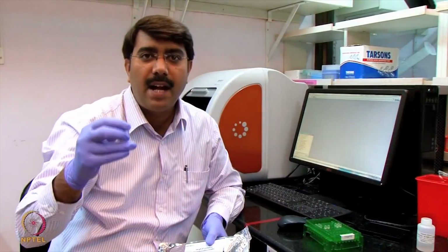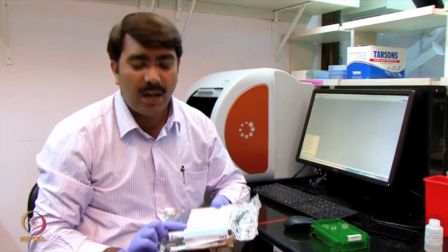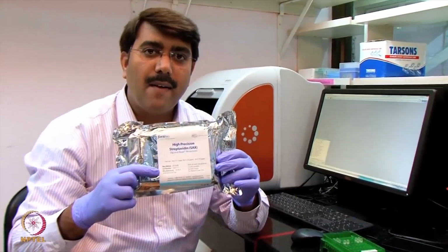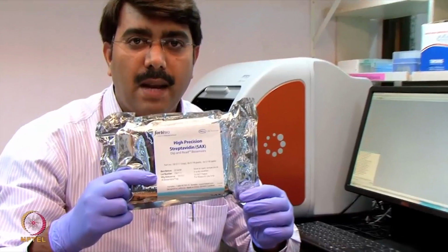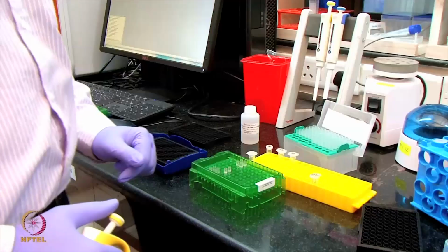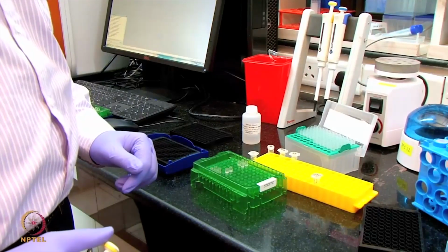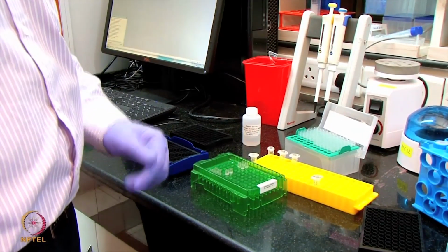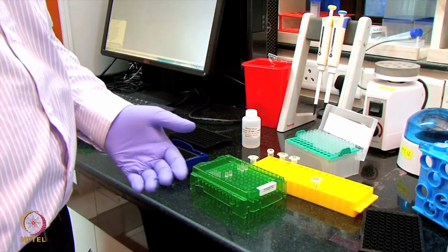The biotinylated antibody, I am going to immobilize onto a streptavidin sensor. This is the streptavidin sensor I am using for the immobilization step. The streptavidin sensor has to be hydrated prior to the immobilization.